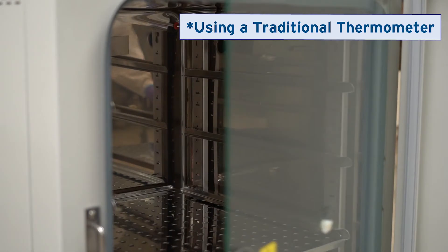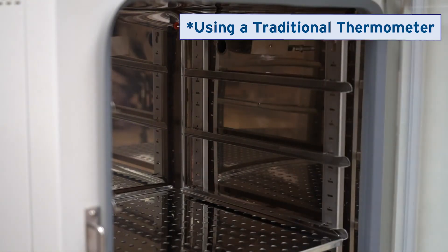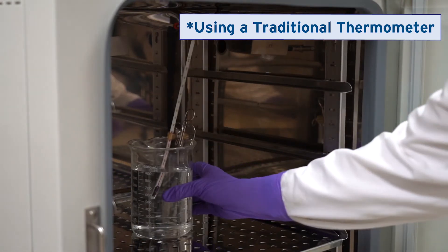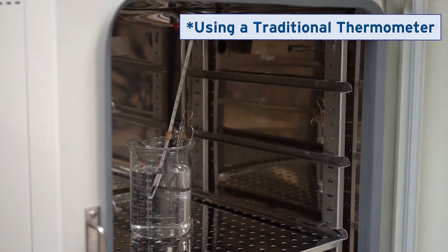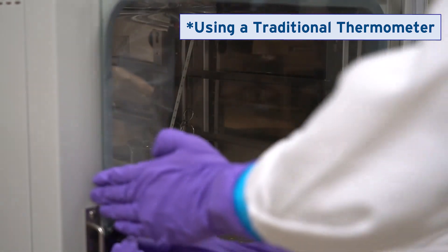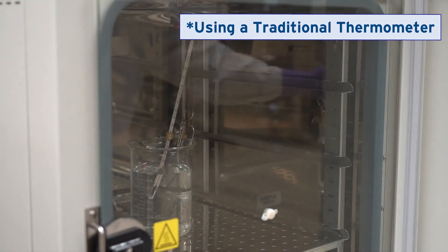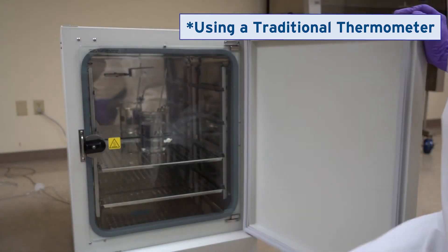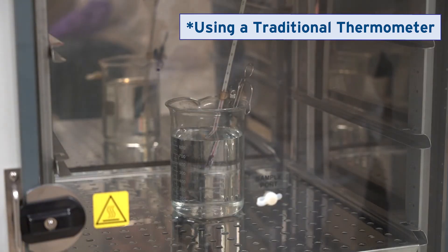Alternatively, if using a thermometer in a water beaker, put it on the chamber middle shelf before stabilizing the incubator for 8 to 12 hours. Look through the inner glass door to take the reading from the thermometer.